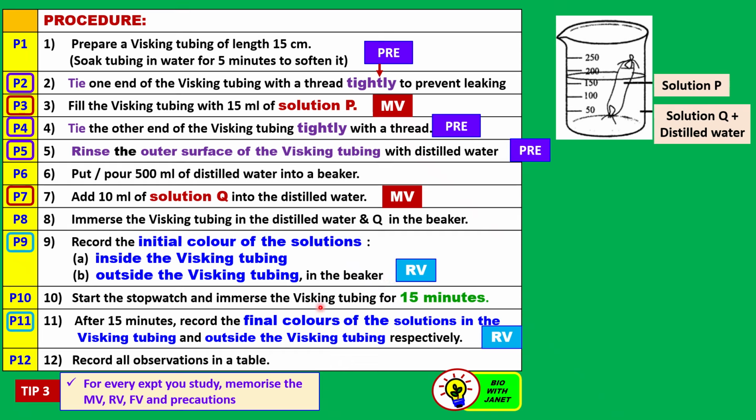Number 10, start the stopwatch and immerse the Visking tubing for 15 minutes. How do you know it's for this time?